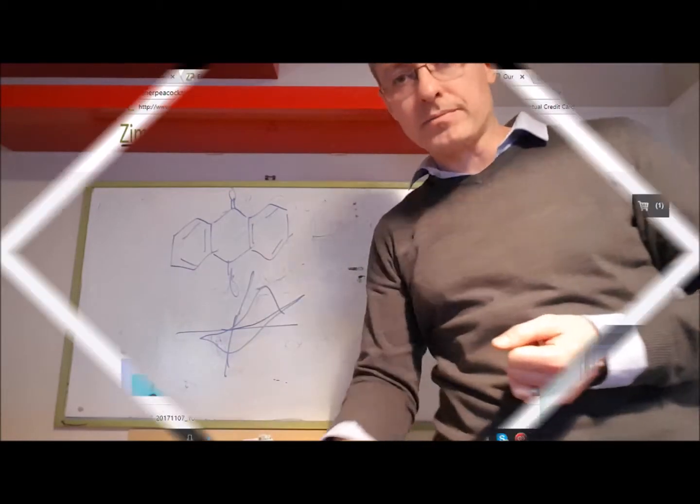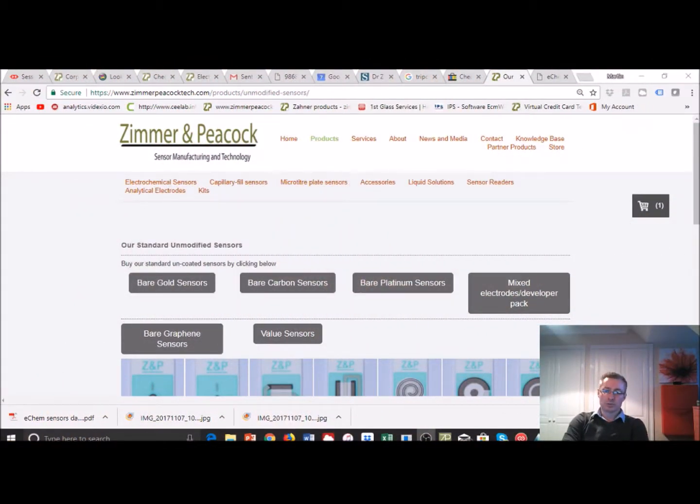Okay, so this is the second part of this video now. In the first part of this video I talked about potentially measuring an engine oil in three ways. Conductivity, impedance and resistance of the oil, i.e. its electrical properties. The second way was, are there any electrochemically active species in that engine oil? And then the third way is, if you want to measure the pH of the engine oil, could we use the electrode surface, if it was carbon? Are there pH sensitive molecules on that surface that we could use to indicate the pH of that engine oil, for example? So let me start off with the idea of measuring an engine oil's conductance.